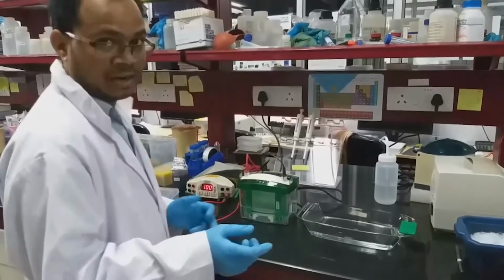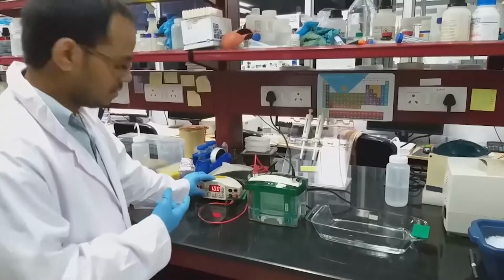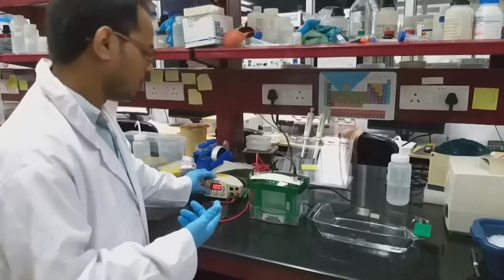So I am going to stop the gel run, then I will remove it. I will show you how to remove the gel.